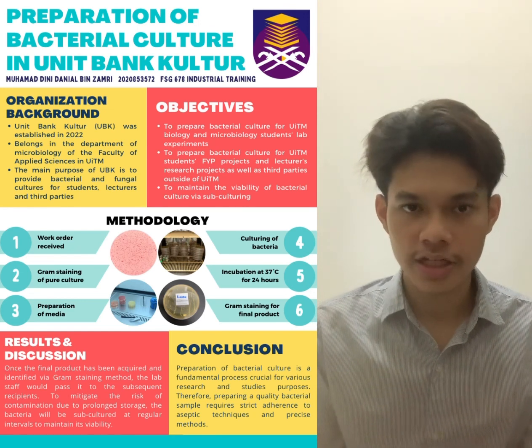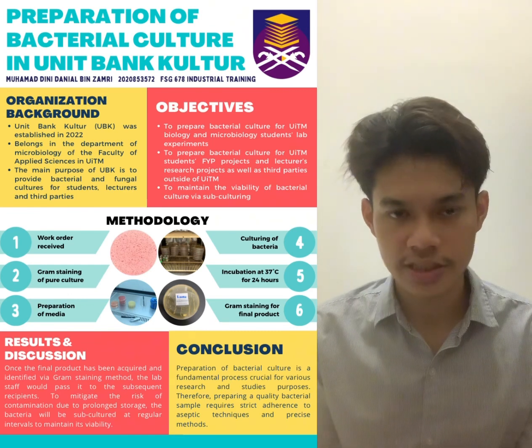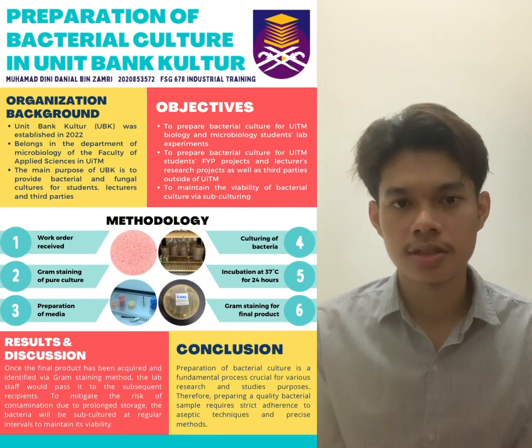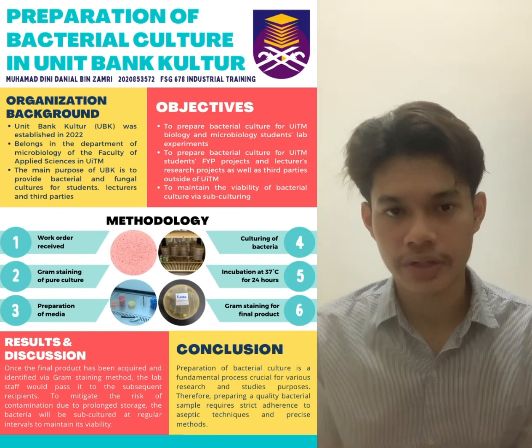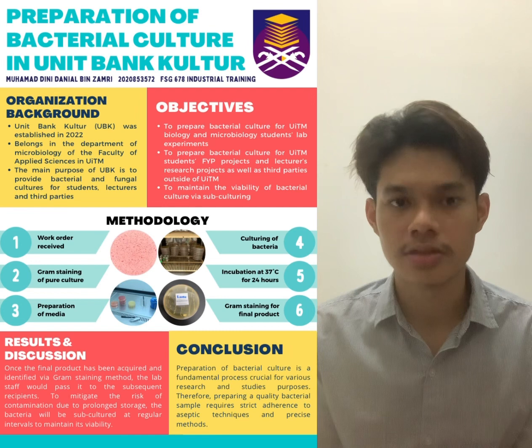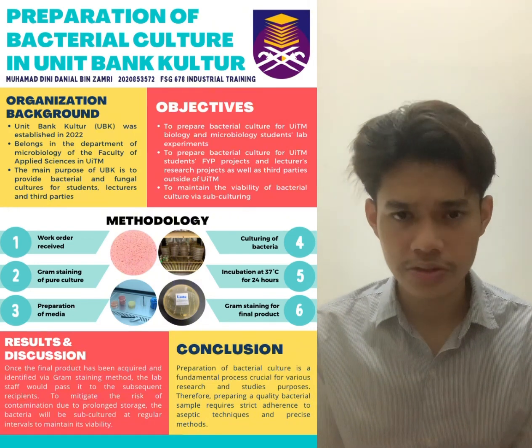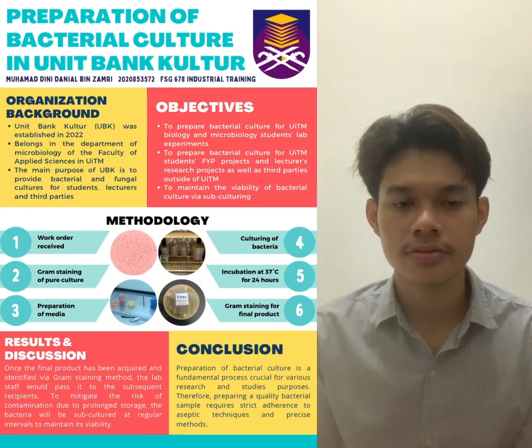Once the final product has been acquired and identified via gram staining method and observation of morphology under the microscope, the lab staff would pass it to the subsequent recipients. To mitigate the risk of contamination due to prolonged storage, the bacterial culture was subcultured at specific intervals, every 2 weeks for broth media and every month for agar media. This is crucial to maintain the viability and quality of the bacteria.